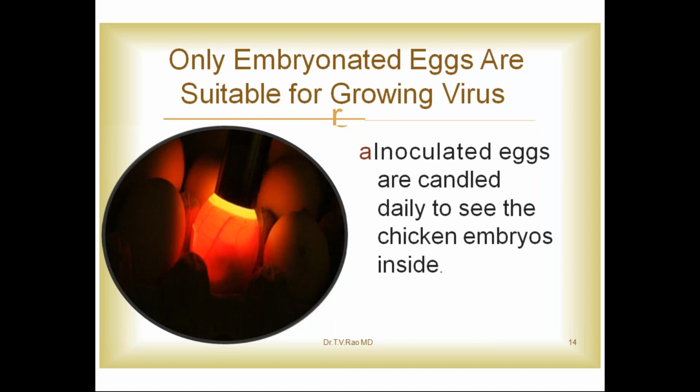Inoculated eggs are candled daily to see the chick embryos inside. What technique do we have to follow? The technique is candling. First, we have to do the candling by using an illuminated light, and observe whether the embryo is live or not.